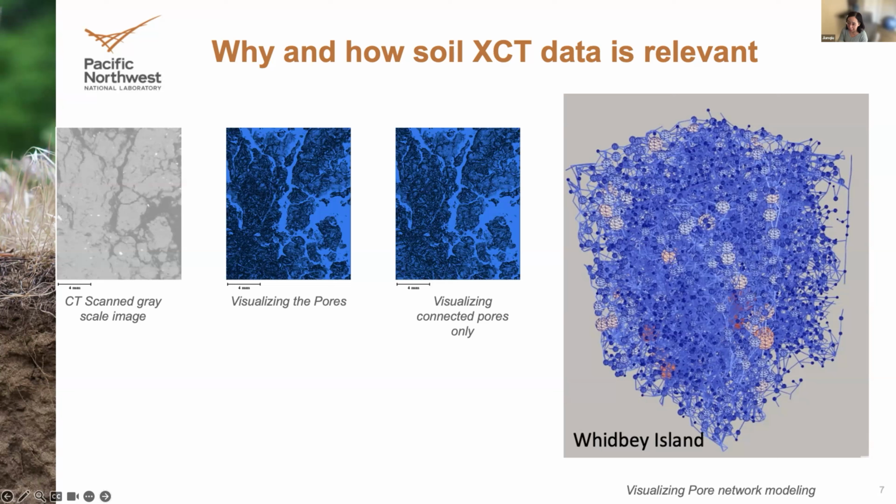It's a wetland soil. You can see that from my 3D pore network visualization on the right. The soil pore network is pretty well connected, but the pore sizes are widely distributed, right? So they're kind of fluffy, and very connected.